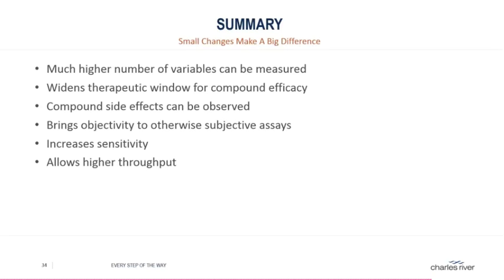Given the automated analysis method, it is objective compared to, for example, test assays that depend on subjective scoring. With the sensitivity, it also provides a wide therapeutic window for possible treatment candidates.